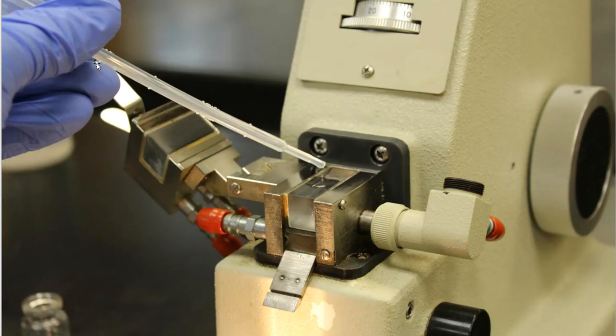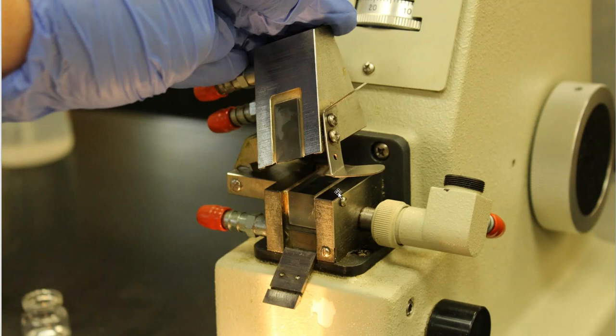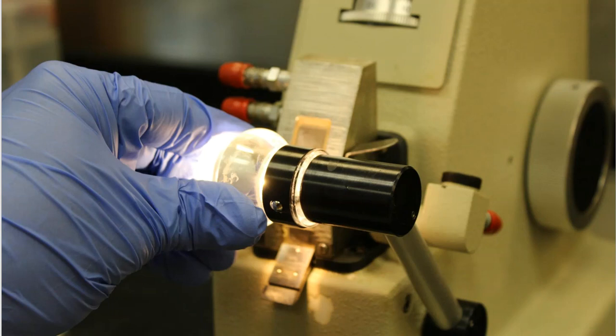All right, so here I just took a disposable pipette, and I sucked up some sample into that plastic pipette, and I put 1 or 2 drops on the surface of the cleaned prism that I have cleaned with acetone or with methanol. So 1 or 2 drops go on, and then I'll close the prism back. There's a close-up of me closing it up, and then I'll raise the lamp back up to that prism area so our light can start going into the prism and going through our sample.